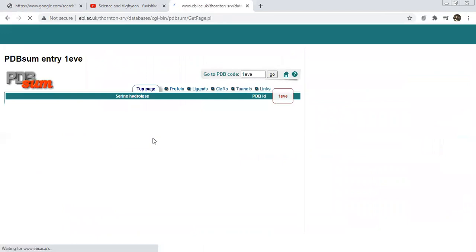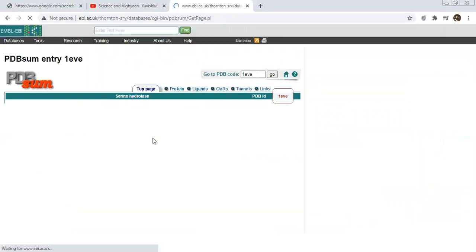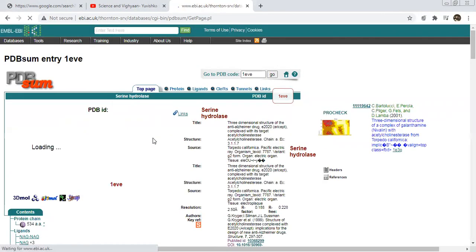We know there are a number of software that are paid only — we can get information about the Ramachandran plot from paid software — but this web server is free software. Whenever you have free time, contribute time here and explore the things on this website.